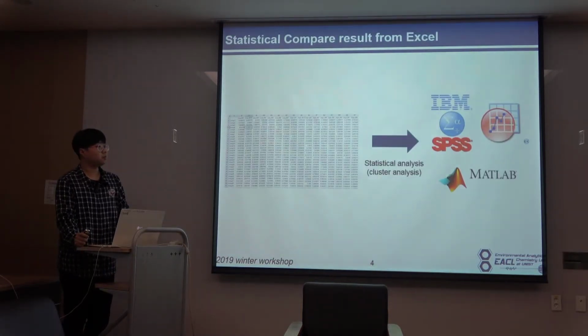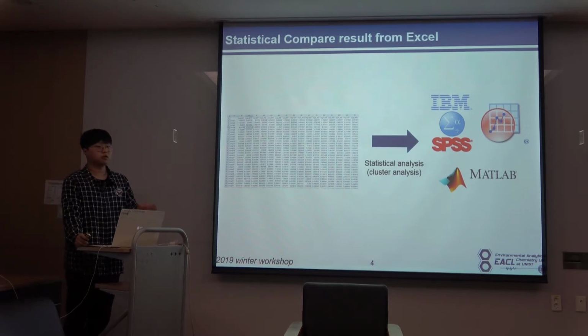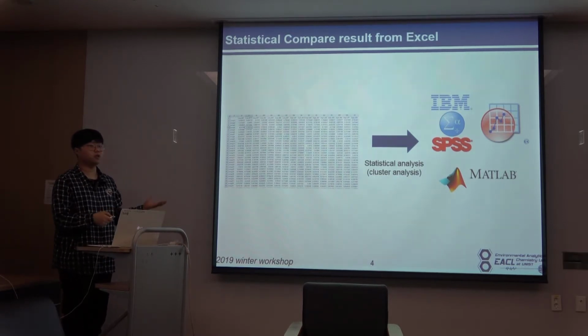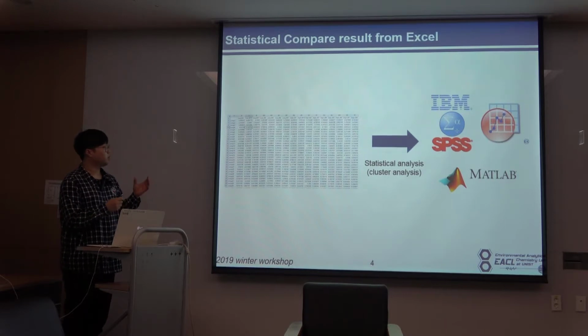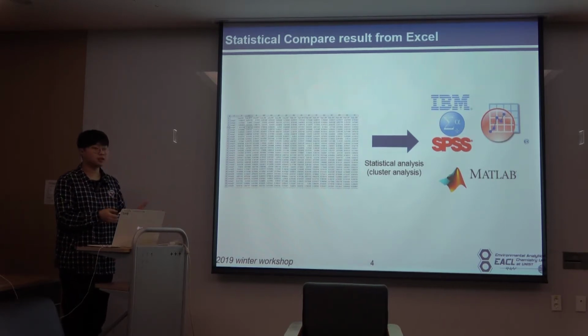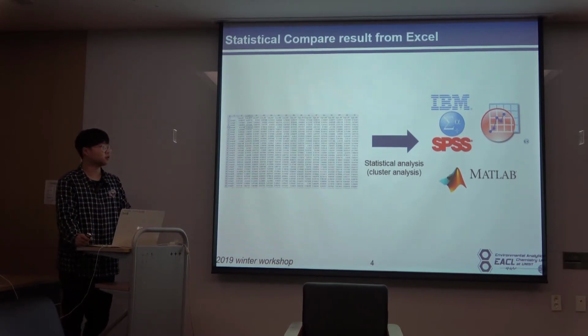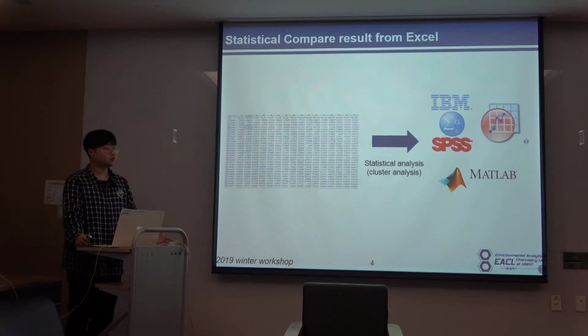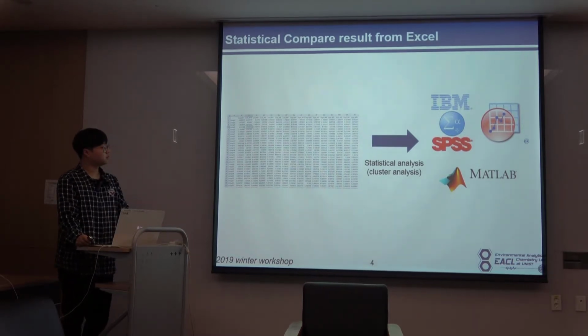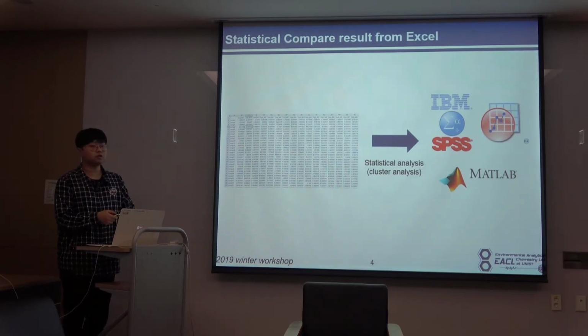Many papers focus on other statistical analysis based on these co-eluted compounds. So we can export this co-eluted information to Excel, and we can apply other statistical analysis such as cluster analysis and PCA. So I will just briefly present cluster analysis for grouping of this information.